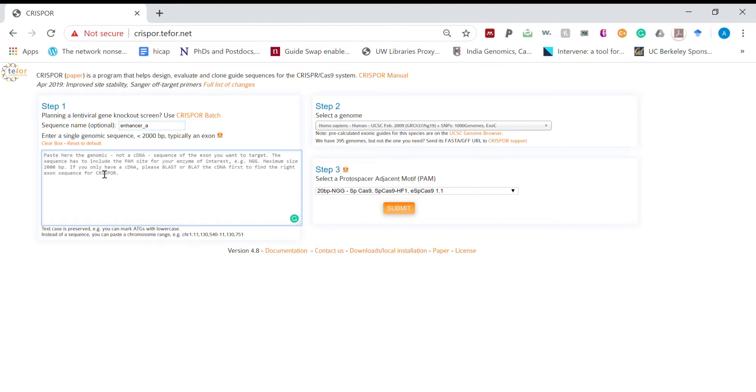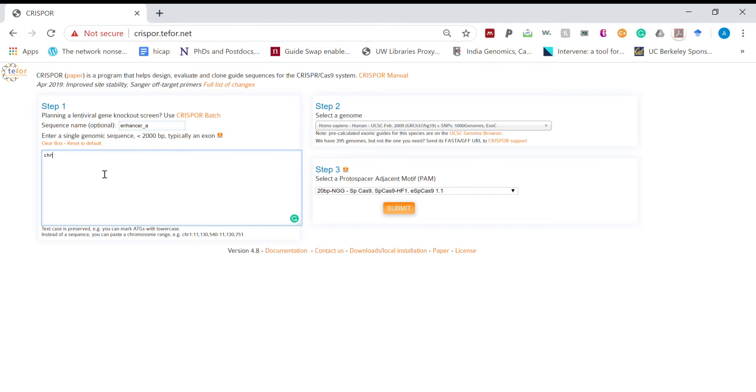In this box either we can add name of the genomic region if it is a gene or we can add chromosomal location. So here we will add chromosomal location.